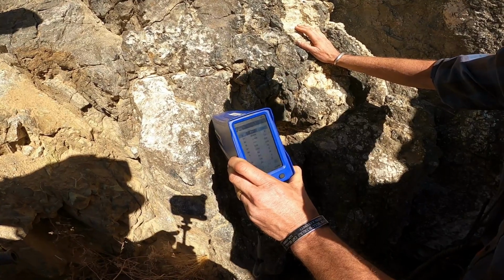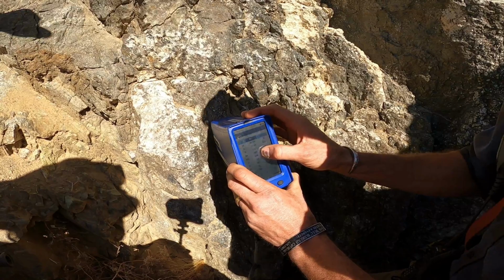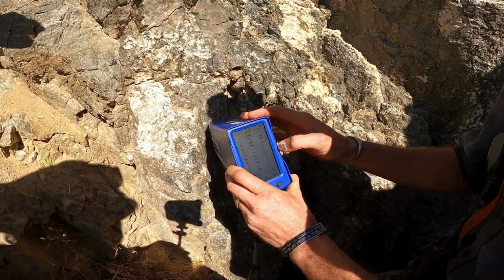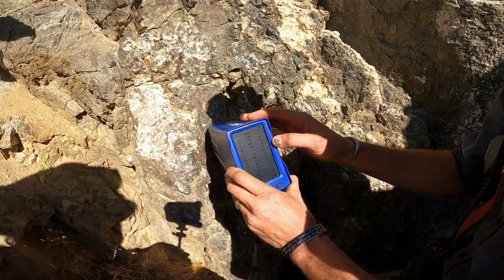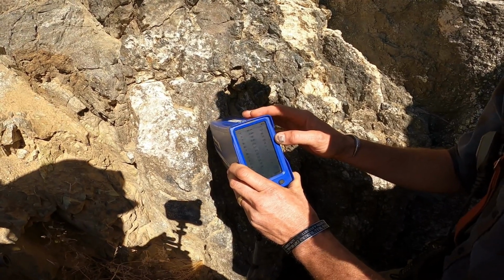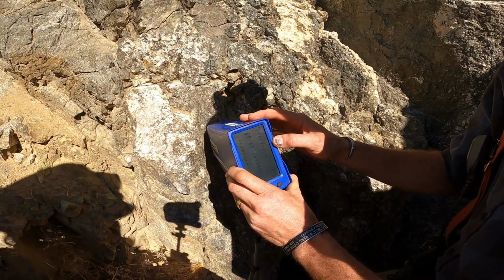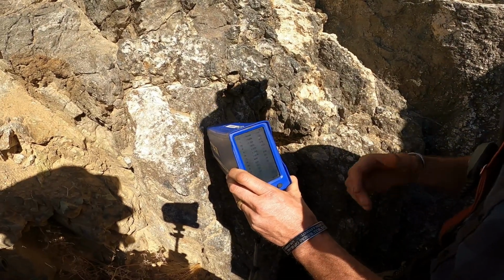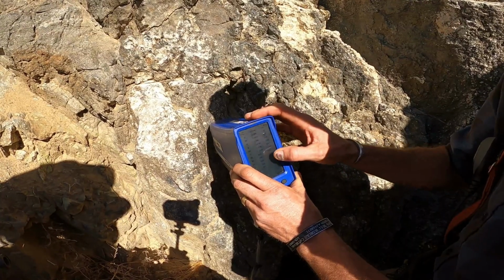All the goodies? Yeah. So we're moving away from the hanging wall. We're already getting kind of lower values in some of the elements in this spot. Yttrium's still there, so we'll see what happens in the second and third beam. Do you recall if the second and third beam is where most of what we want to see shows up? I forgot. It's the third beam. Yeah, I had the third beam defaulted at 10 seconds, and I put it at 30 just so I could get my error rate down a little bit so I would believe it.